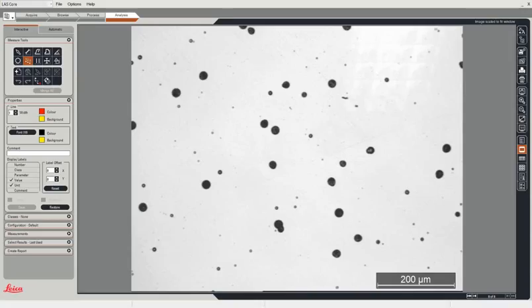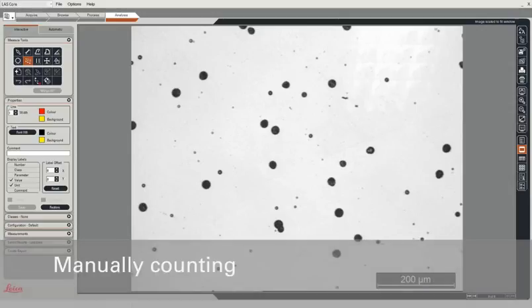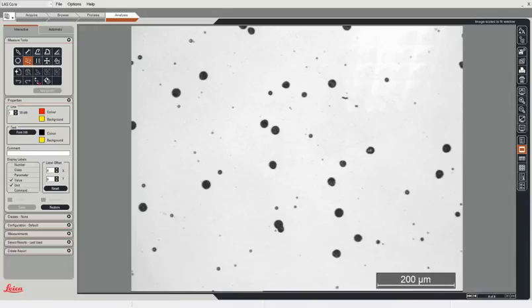One of the measurements that is frequently required in examining images is a simple way to count the number of objects that are in the field of view. In this simple alpha track specimen, you might think that you can easily click on each individual object and count the tracks. It's quite simple and doesn't take very long to count one image.